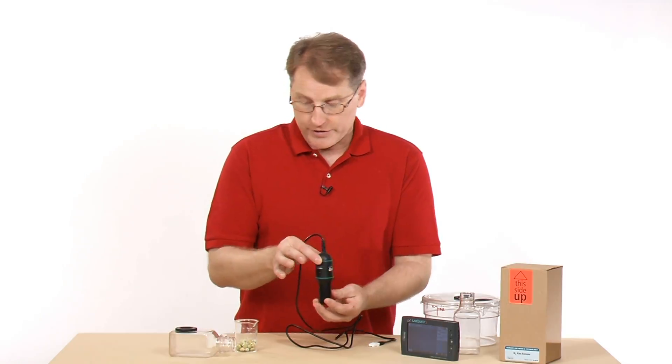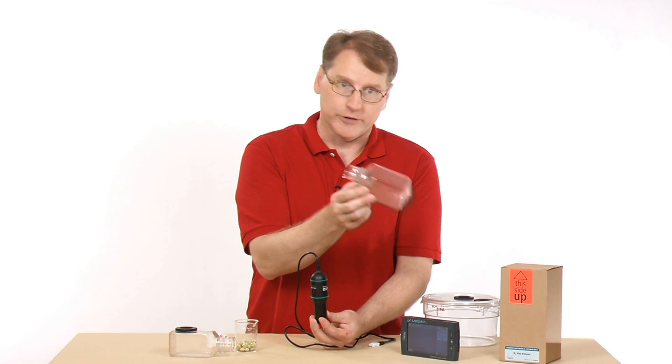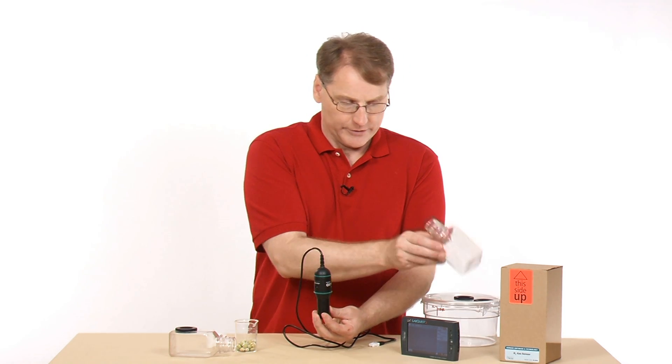Now, the oxygen sensor comes with a Nalgene bottle. And so this bottle here is the standard one that would be in there. And so it comes with that one.